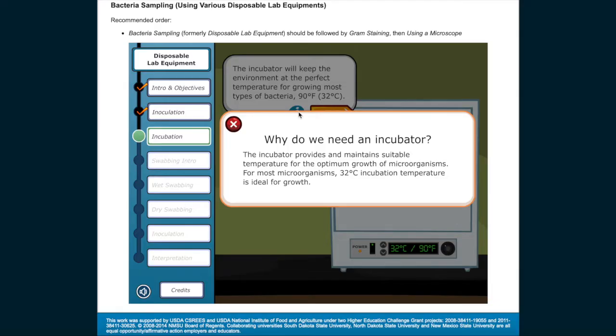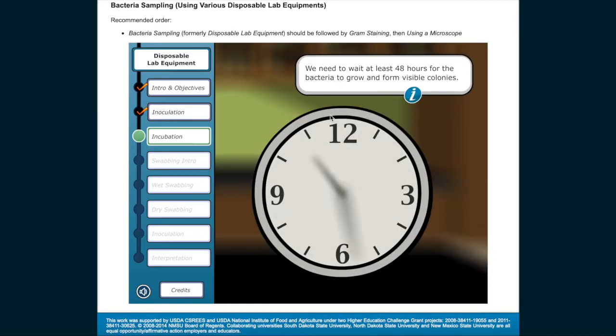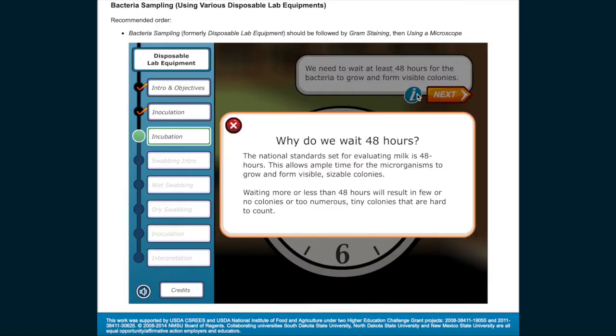Why do we need an incubator? The incubator provides and maintains suitable temperature for the optimum growth of microorganisms. For most microorganisms, 32 degrees Celsius incubation temperature is ideal for growth. We need to wait at least 48 hours for the bacteria to grow and form visible colonies. The national standard set for evaluating milk is 48 hours, allowing ample time for microorganisms to grow and form visible, sizable colonies. Waiting more or less than 48 hours will result in few or no colonies, or too many tiny colonies that are hard to count.